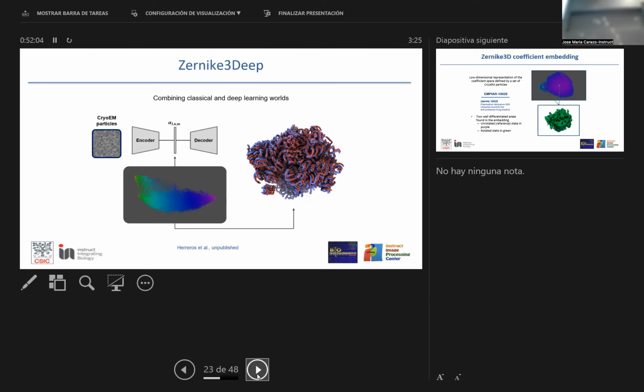Probably it was obvious, but we didn't think about that for some months. And we were getting different answers, and I mean, the purification had a problem, and there was no problem at all, is that we were not properly stating the conditions in which we were making the analysis.